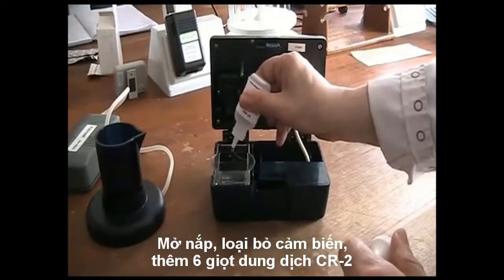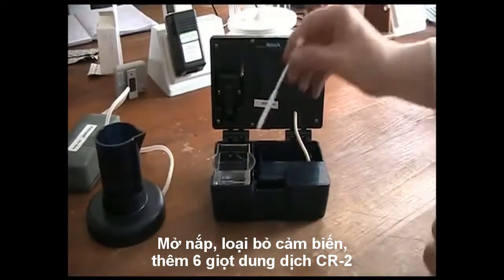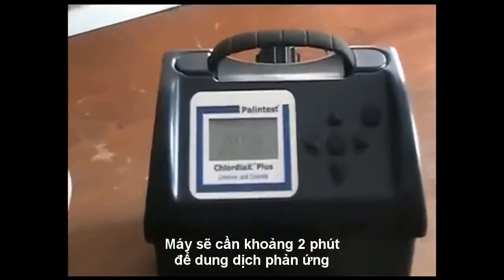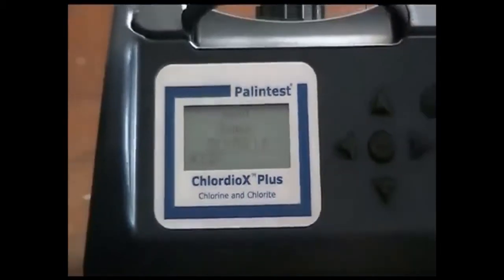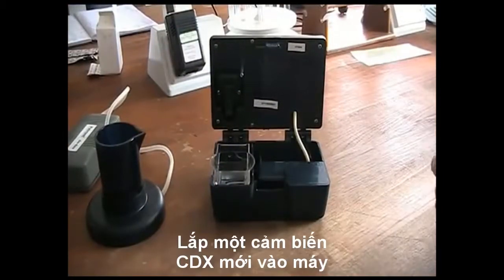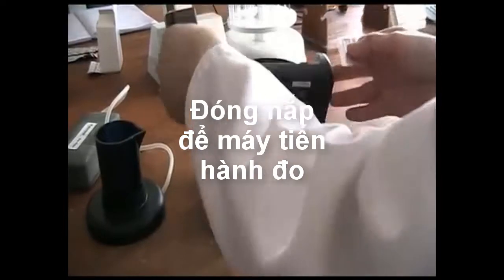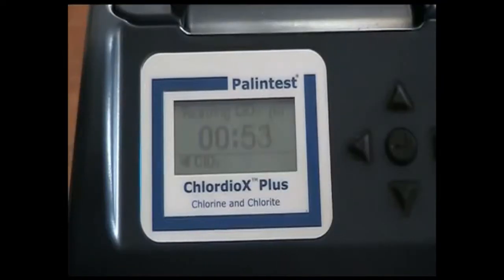Add 6 drops of CR2 reagent and gently stir, then close the lid. There is now a 2-minute reaction time indicated on the screen. At the end of the 2-minute reaction time, insert a fresh CDX sensor and gently close the lid. Again, the measurement time is 1 minute.